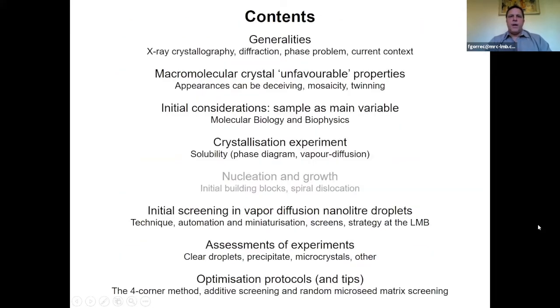Right, so I'm going to try to introduce macromolecular crystallization. Macromolecular crystallization is applied to other things than proteins, such as protein complexes with DNA, RNA. So the approach is employed for different types of macromolecules, but we usually stick to saying protein crystallization.